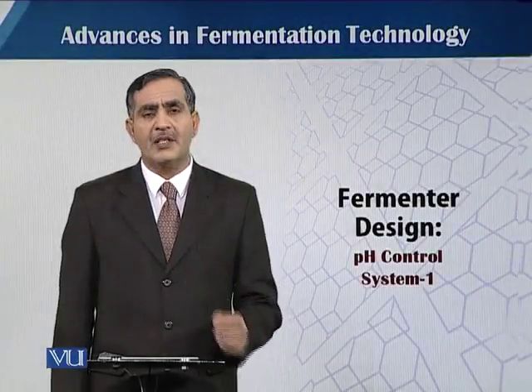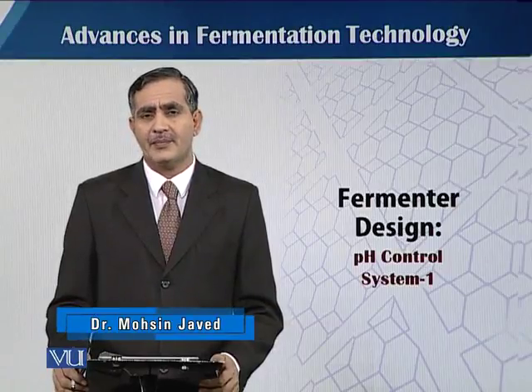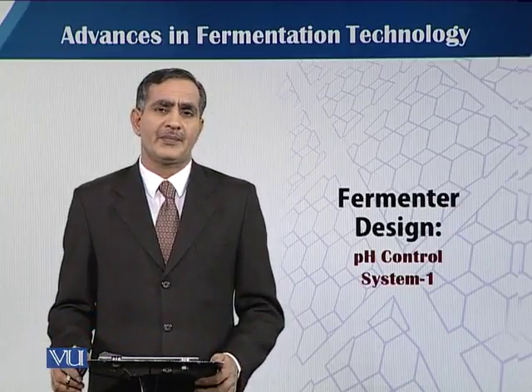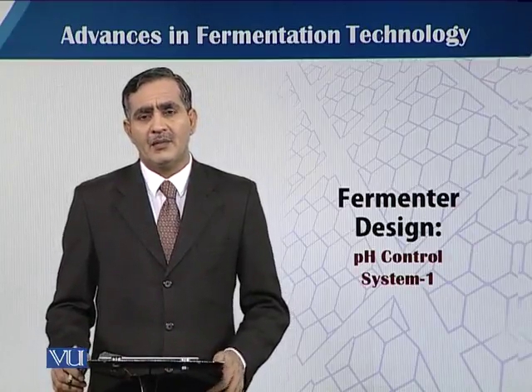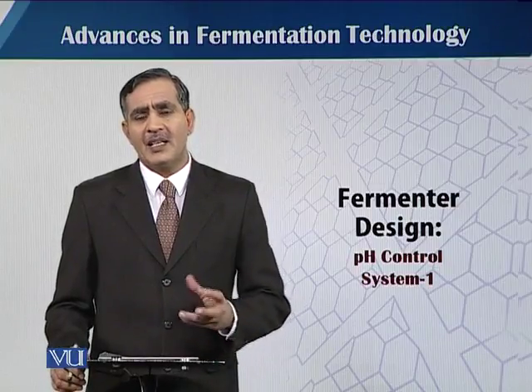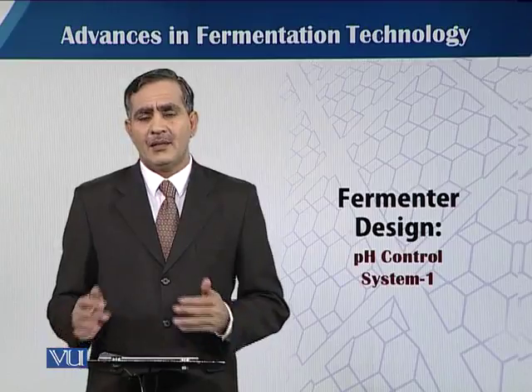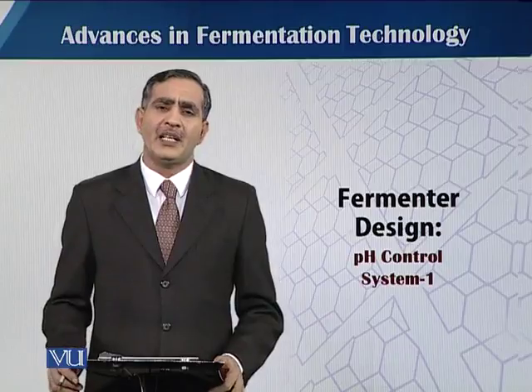In this module, we will talk about the pH control system while designing a fermenter. pH is very critical. All biological systems require a specific pH. Minor changes in pH are controlled by the buffering capacity while designing the medium, because we add some buffer compounds which can check and control minor changes in pH value.